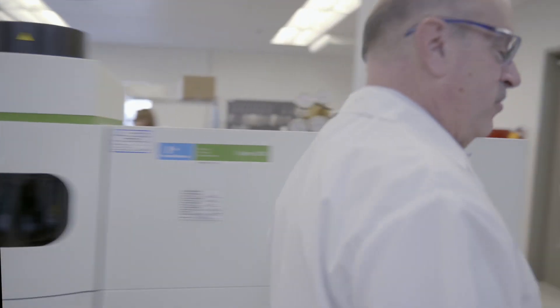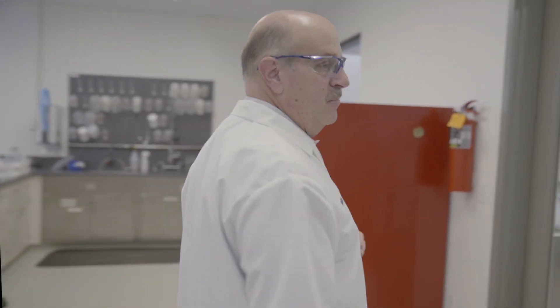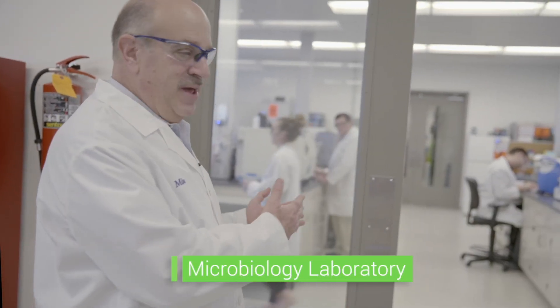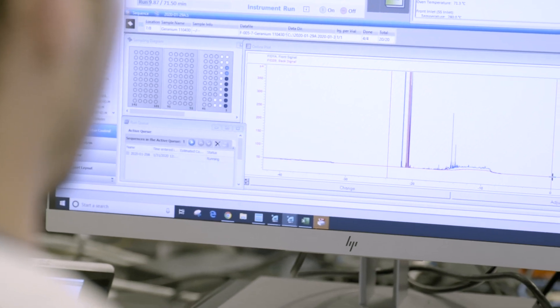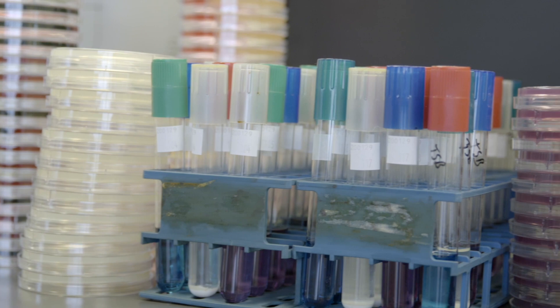Now finally, let me walk you over here and show you something that most people never get to see. This is our state-of-the-art microbiology laboratory, and of course we have microbiologists working in here all the time to ensure that our products don't contain any nasty bacteria or yeasts or molds. We test each and every product thoroughly for microbes. This is just some of the things that we do to ensure that you're getting the absolute best CBD products from Nature's Ultra and Young Living.